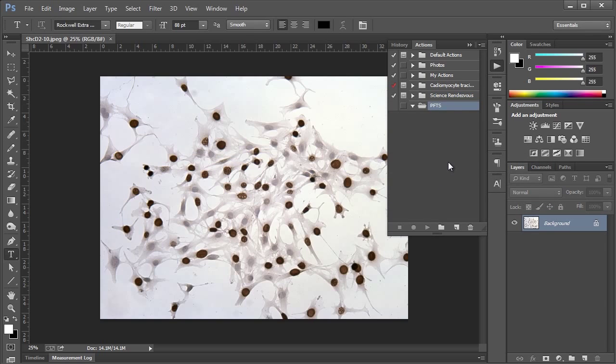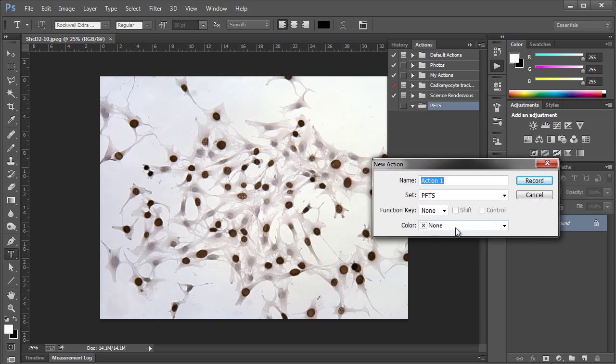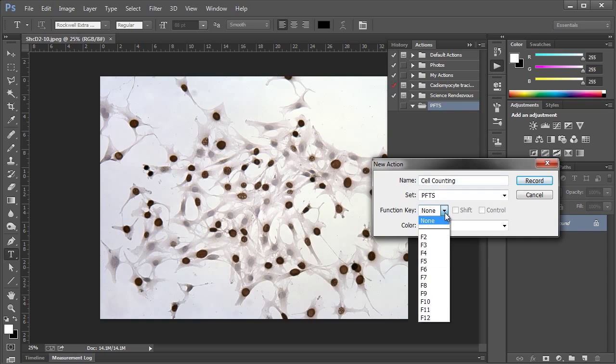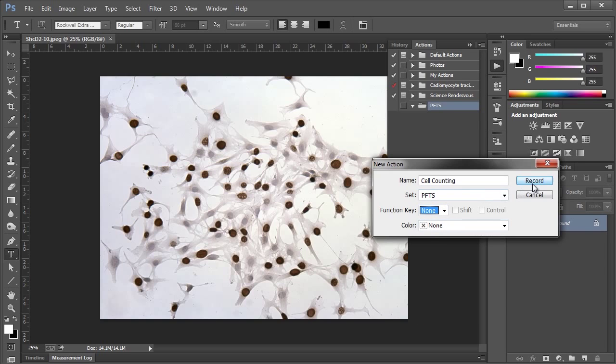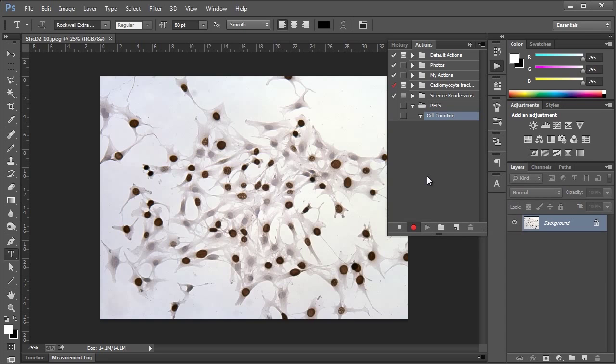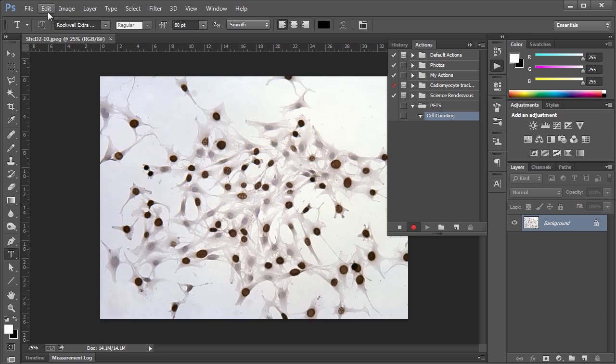And now we're going to create a new action, so we can click this little new page icon here, and we'll call this action cell counting. And we can assign a function key if we want, but I don't really care to do that right now. So we'll say record, and now we're recording. So the good news is this isn't recording in real time or anything like that. You can move your mouse around as much as you like. But what this is recording, basically, is all of your clicks and what menu items or tools you're selecting.